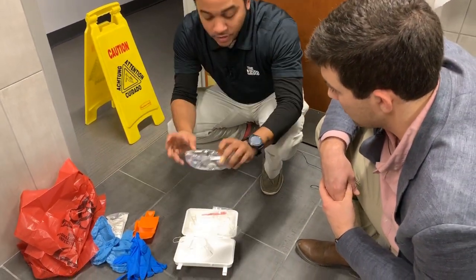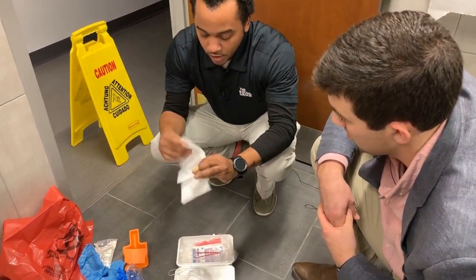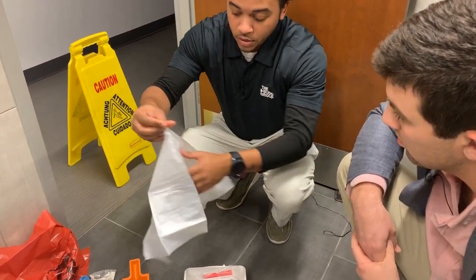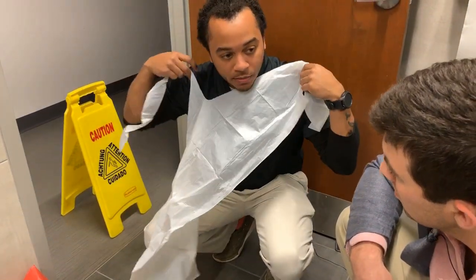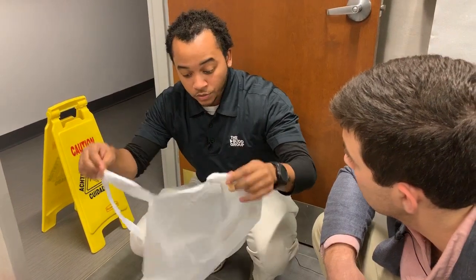And we have our safety goggles. And this is absorbent, and you place it over yourself, and it goes around you like a smock. Okay. Therefore, any splatter or anything like that that were to get on you gets on here.